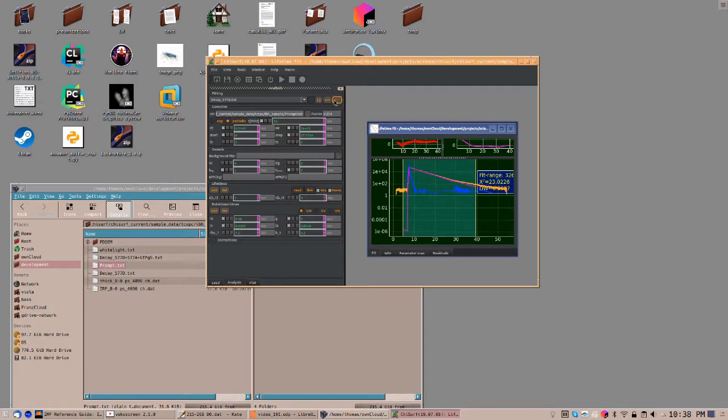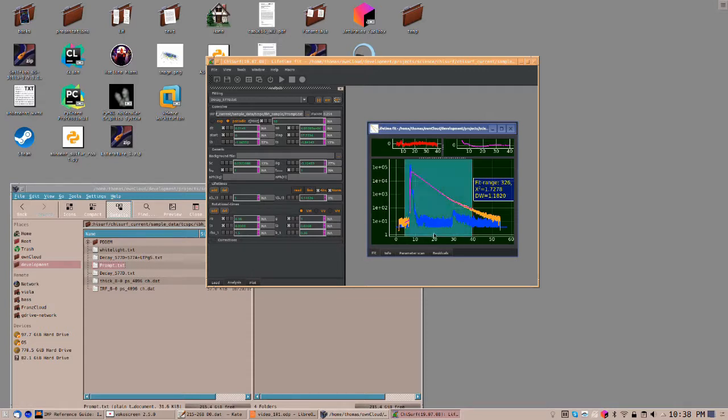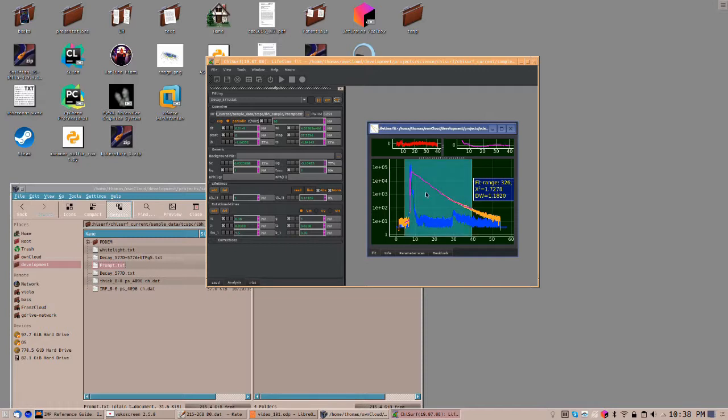To optimize the parameters, click on Fit. Once you click on Fit, all parameters that don't have the first checkbox checked will be optimized against the data. This fit, as you can see here on the top left by the weighted residuals, is not very good. To the right, the autocorrelation of the weighted residuals is shown. This chi-square is 1.7. It's not very good. Probably we need more components to fit the data.